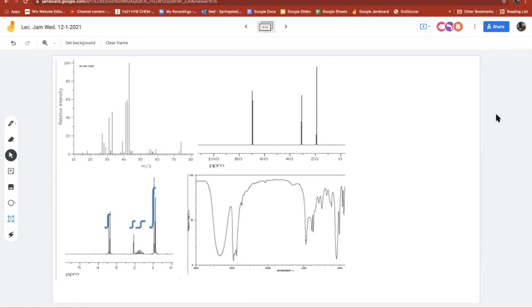So on this problem, I'll give you an example. I'll give you a problem like this on the exam too. You'll get one of these. You have to look at this thing and figure out the molecular ion. This looks like the molecular ion right there. Where is that at? That's at 70, 71, 72, 73, 74. That's 74. So it's not odd. It looks like no nitrogens, right?